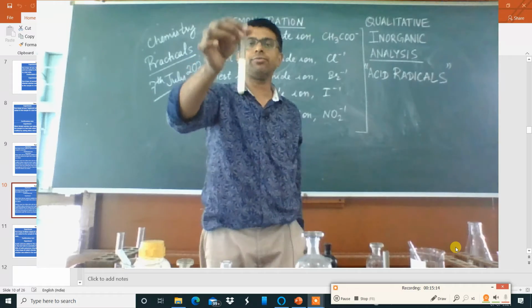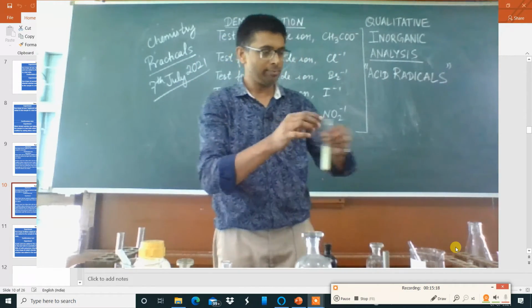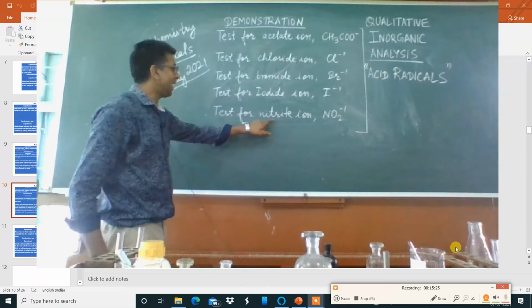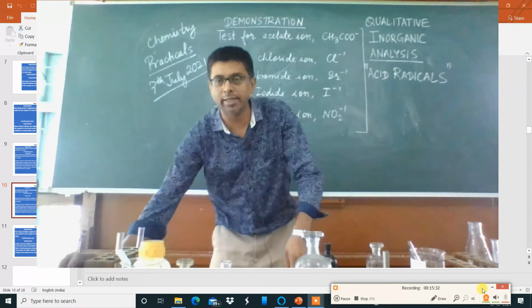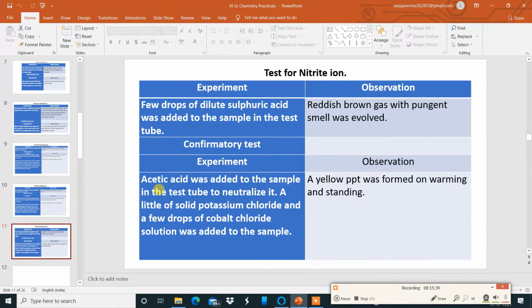Then after that, I went further to talk about and show you the test for nitrite ion. After this, I showed you the test for nitrite ion, I remember. Now this test for nitrite ion also includes two parts. The first one is the preliminary test and the second one is the confirmatory test.